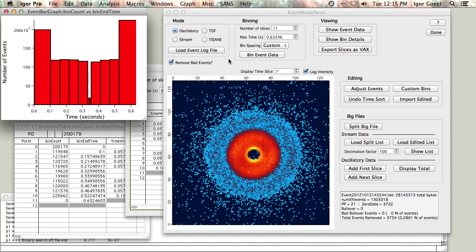So if you have something that, say, has a linear decay in the kinetics, you'll want linear time bins. If you have something that's very nonlinear, you'll want to adjust and make nonlinear time bins. Not knowing what everybody's data set could look like, I'll leave it up to you to set the bins. If you have a particular bin setting that you would like and you can prove to me that it's appropriate for more than just you, it can be added to the package. Contact me when you have the data.